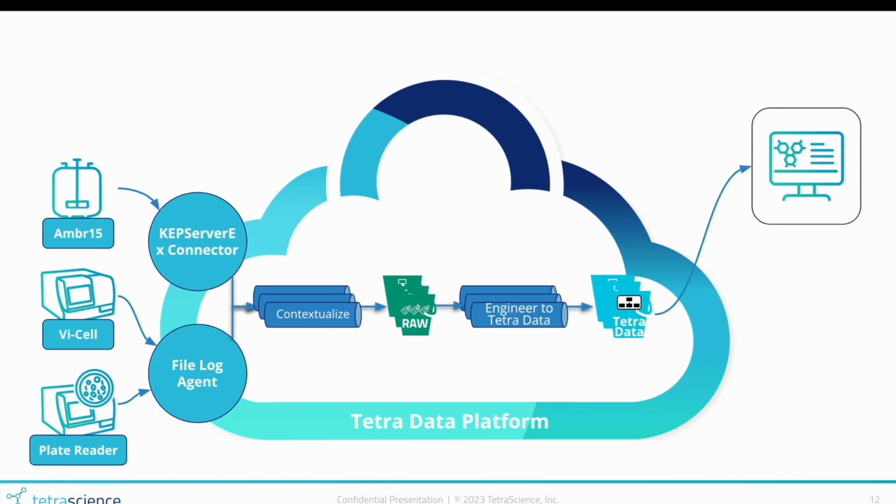This data is then made accessible through SQL and API endpoints to analytics dashboards. And because we've standardized ontologies, it also makes it very easy to export this for machine learning processes downstream.